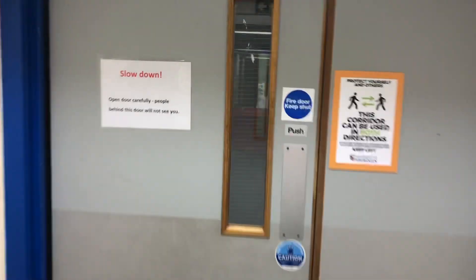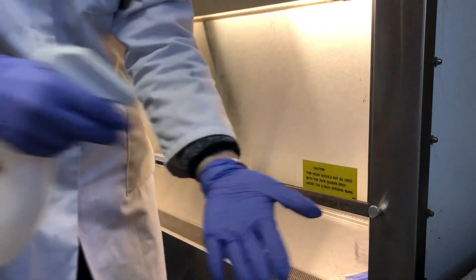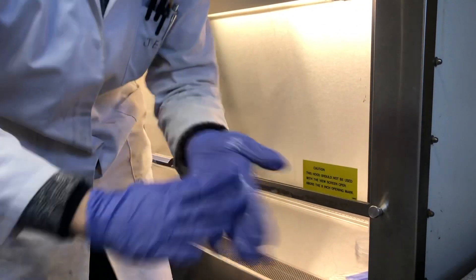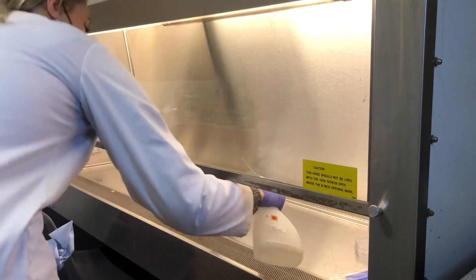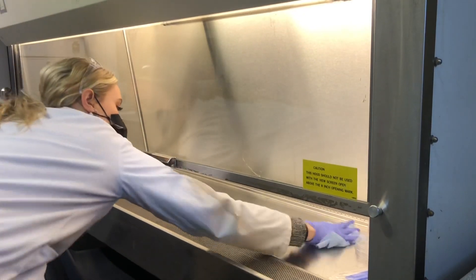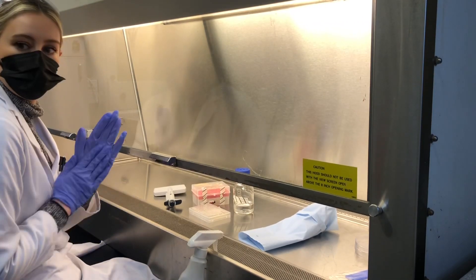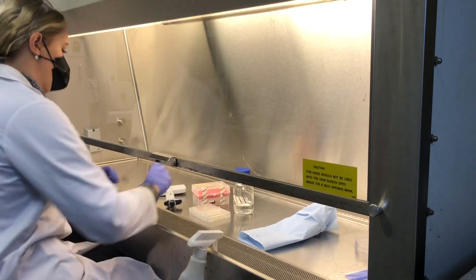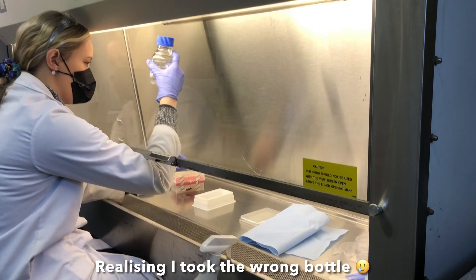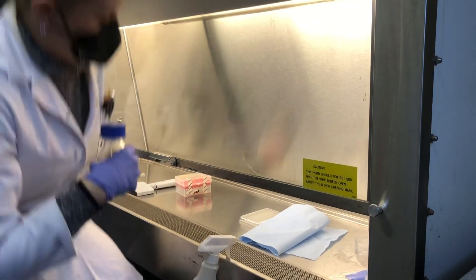Let's take some growth readings. I've got some growth here.